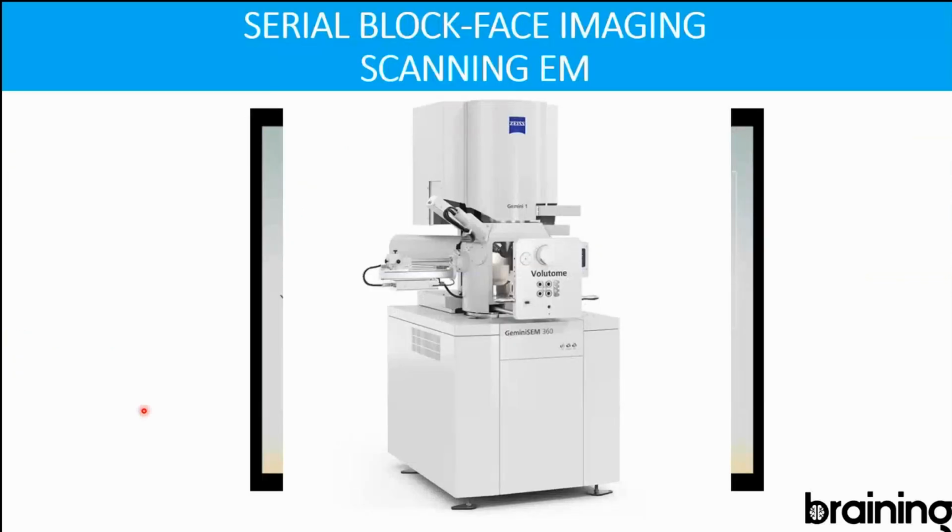And this is just to finish. I've been talking about the processing of samples and tissues for conventional and immunostaining for EM, for regular microscopes. But lately, there have been some improvements in the electron microscope equipment, because since the early 1950s the only thing that hasn't changed is the software or some things like that.